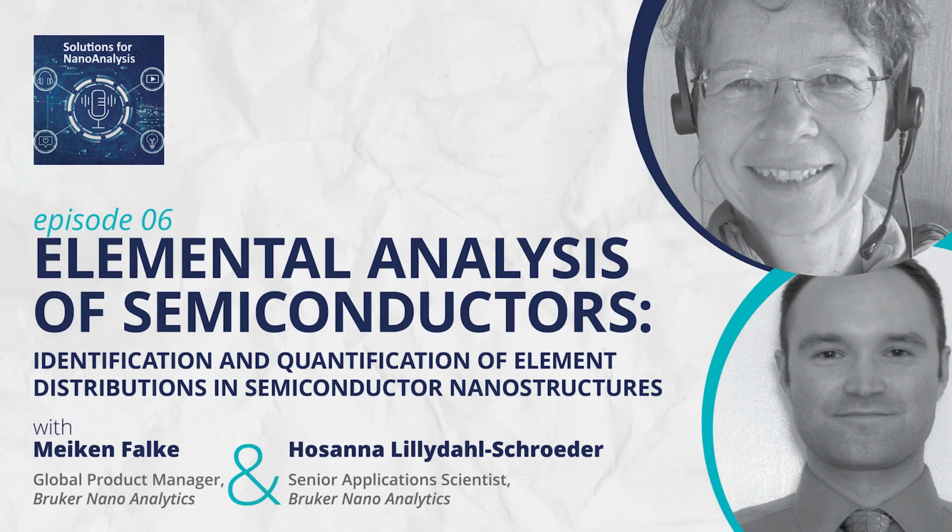So since we're talking about different length scales, basically, and further miniaturization of various chips and semiconductors and other materials in that particular industry, what type of length scales would we be seeing use for in these studies as far as application for TEM versus SEM? What would be some good or relevant examples where each technique, or type of microscope, would be appropriate?